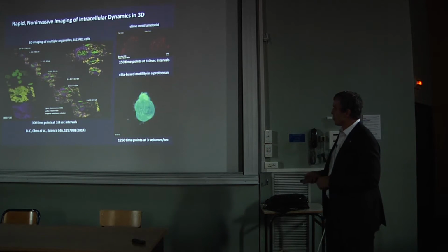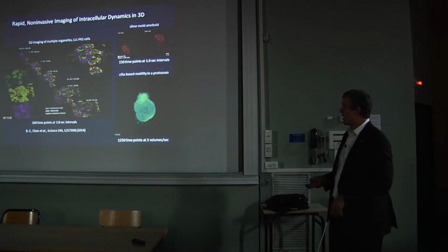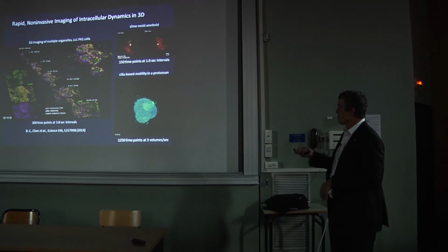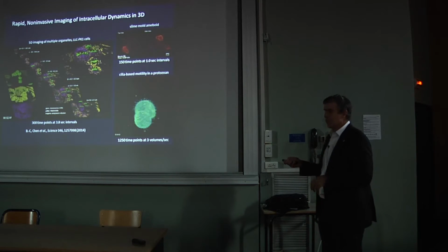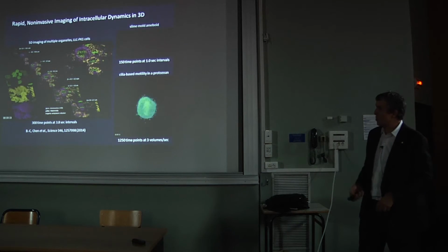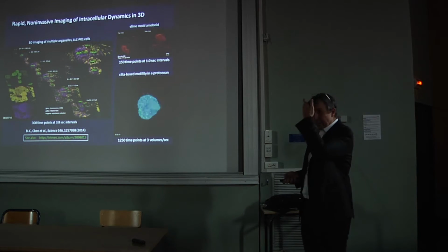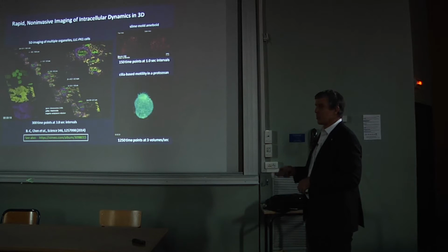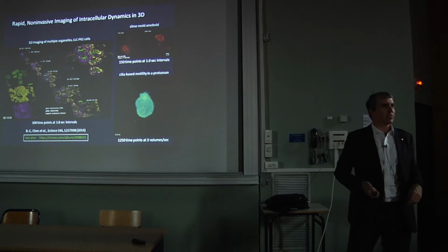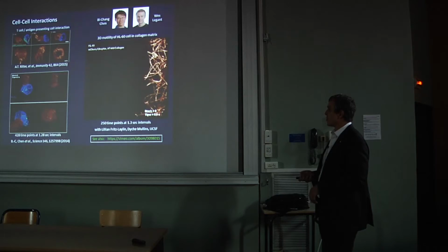Here's yet another example, Tetrahymena. It's a protozoan like you'll find in a pond. In this case, it's trapped inside of a pocket of agarose, and he's sort of frantically trying to get free for over 1,000 time points, and again, no damage to that specimen, no bleaching to that specimen. If you like these movies, this paper came out last year in Science. You can also find on Vimeo an album that has about 40 examples of this kind of thing. Or if you just Google lattice light Vimeo, you'll find it right away.